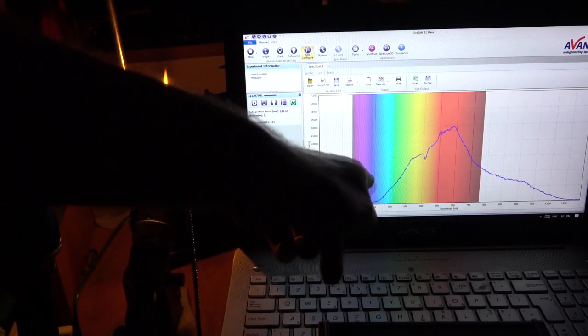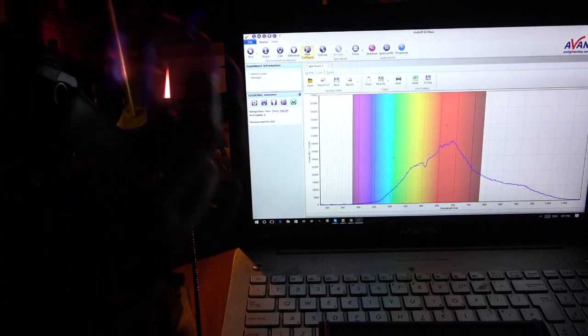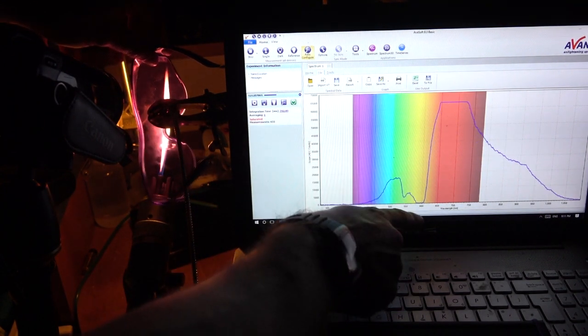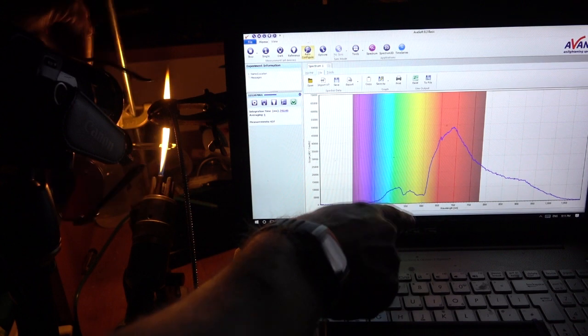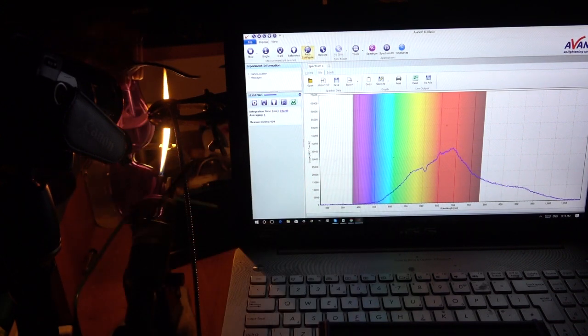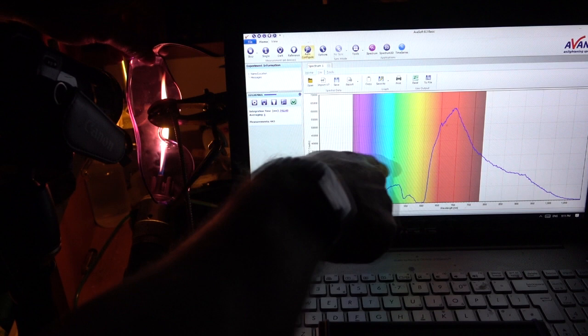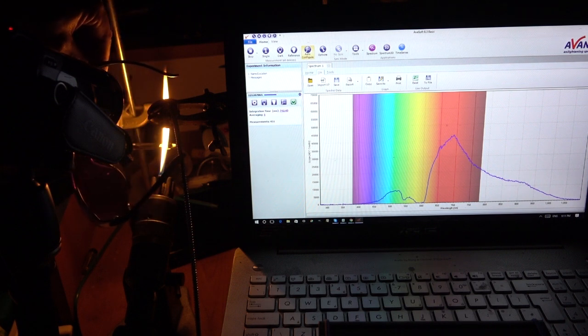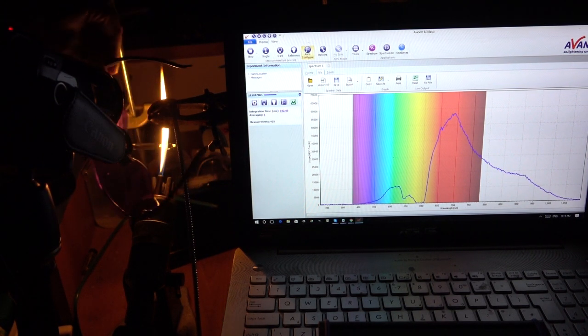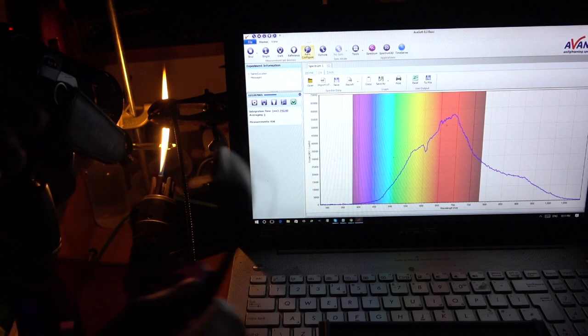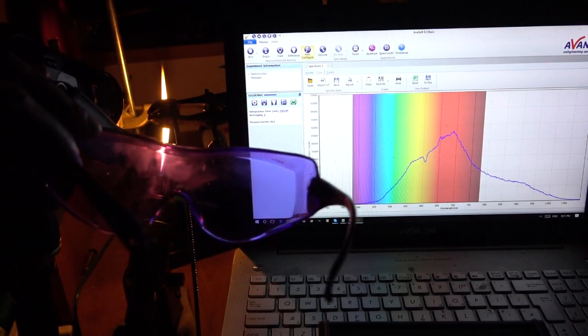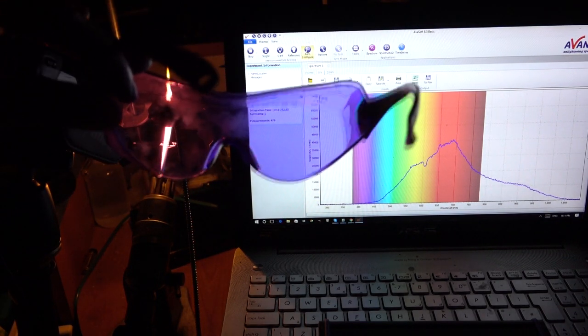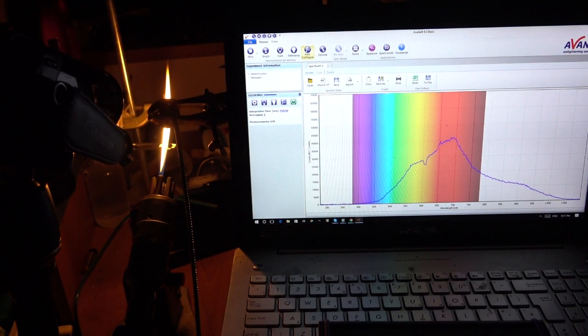So you've got this very selective absorbance in the yellow. And I'll show you that really quite nicely. So if I just kill the oxygen for a second. Right. So now we have our nice orange flame that we had previously. And I'm going to put my specs in there again. And what you'll find is now you see this really strong absorbance. That's 600 nanometers. And the sodium line is 580, or the sodium doublet. So it's got this really selective absorbance in the yellow. So not only are these things necessary for glassblowing, they're also quite cool for astronomy. Or they used to be. And that's because a lot of the street lights are sodium street lights. And I'll show you what that looks like now.